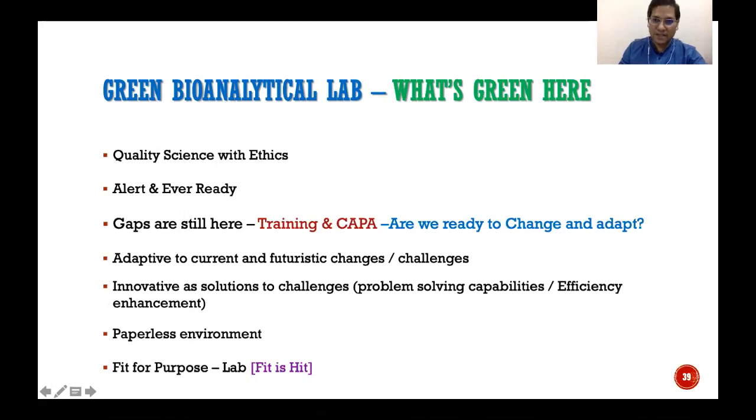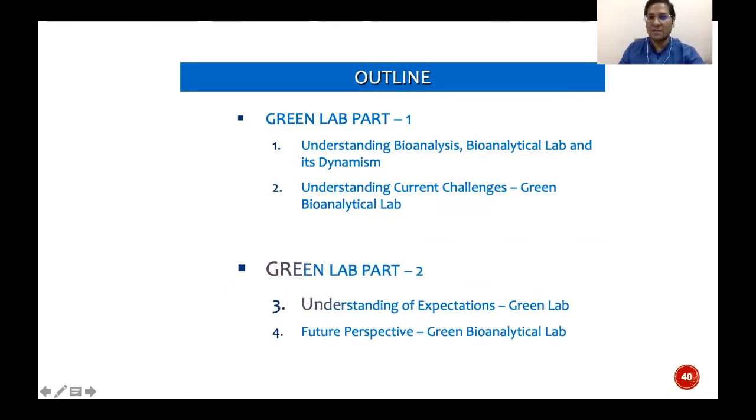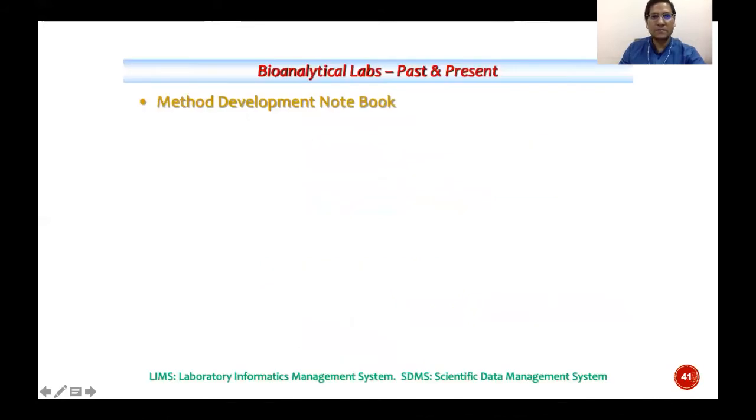We are definitely, as a green lab, targeting a paperless environment, and ultimately my lab has to be fit for the purpose. So let's move one step closer to green lab. Let's move to the second part of this lecture: understanding the expectations of a green lab.